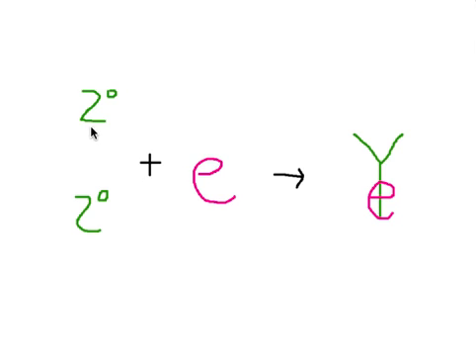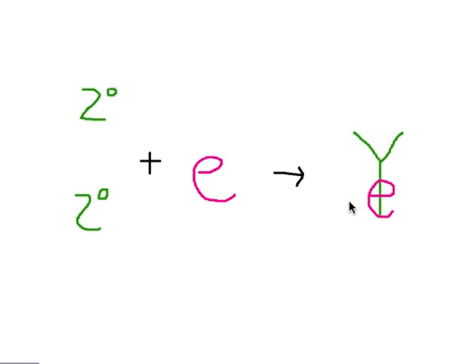So then we take the secondary antibodies and then we can bind them to an enzyme, just a covalent bond, where now this is labeled with this enzyme. The enzyme will, when introduced to a substrate, cause a color change.